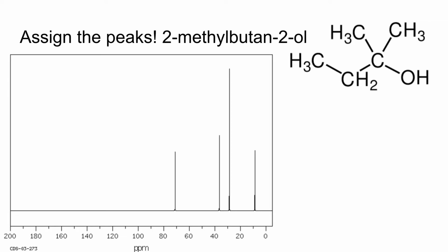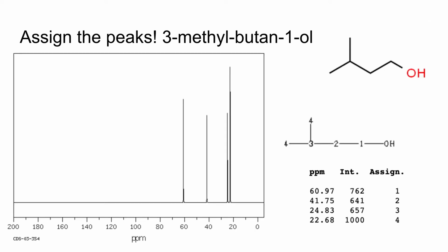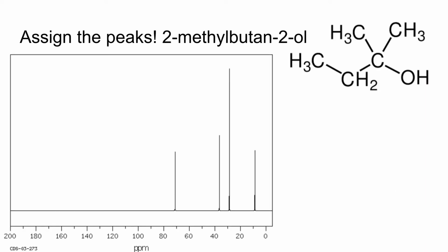Wait, which carbon were we referring to? The carbon bonded to the OH. It's moved from a primary alcohol at around 60, and in this tertiary example, it's more downfield. It's more deshielded at 70. Why is it more deshielded in a tertiary case versus a primary case?